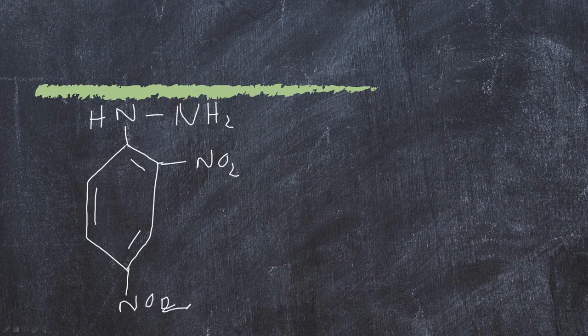This is the 2,4-dinitrophenylhydrazine, and like I said earlier, it will react with the carbonyl group. This is the carbonyl group as we all know it.